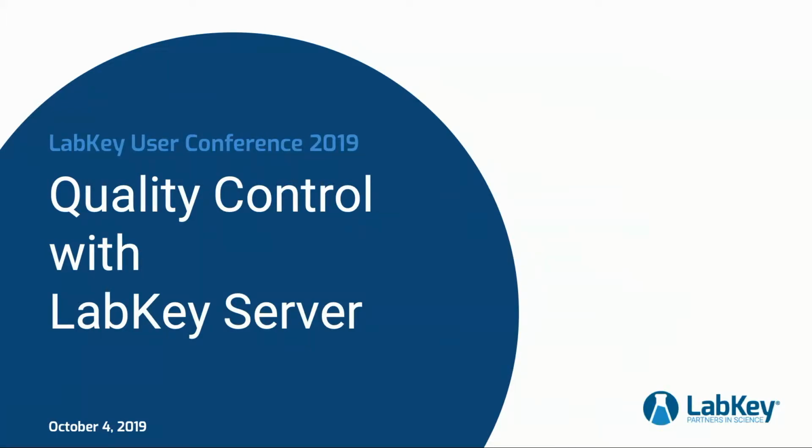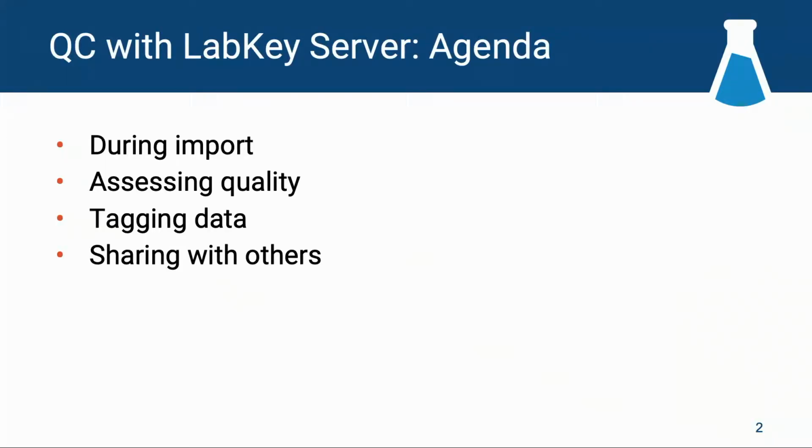For those who don't know me, I am VP Engineering here at LabKey, and I've been involved in a lot of different aspects of LabKey Server over the years. But one of the areas that I've had my fingers in for a while, on and off, is quality control. And that is really a pretty broad category of things. It means a lot of different things in a lot of different contexts. And so what I've tried to do as part of organizing this is break it into a basic workflow and steps along the way where QC might come into play.